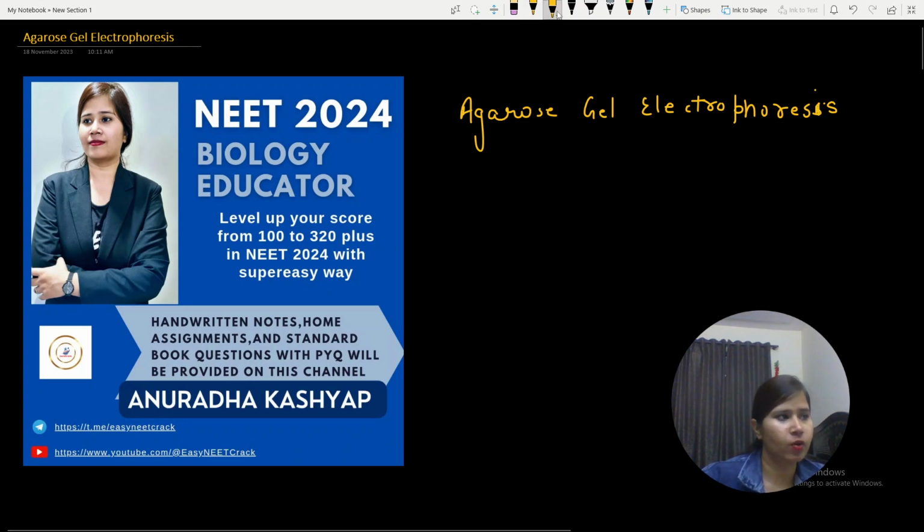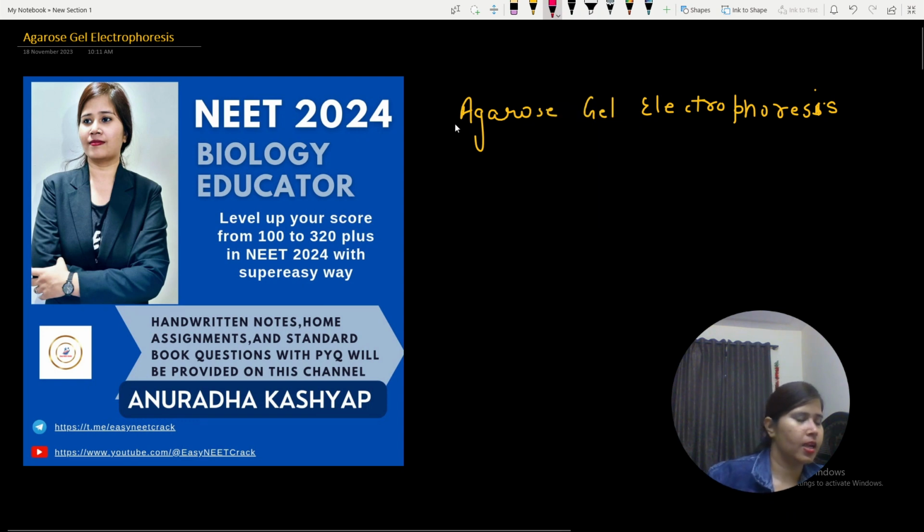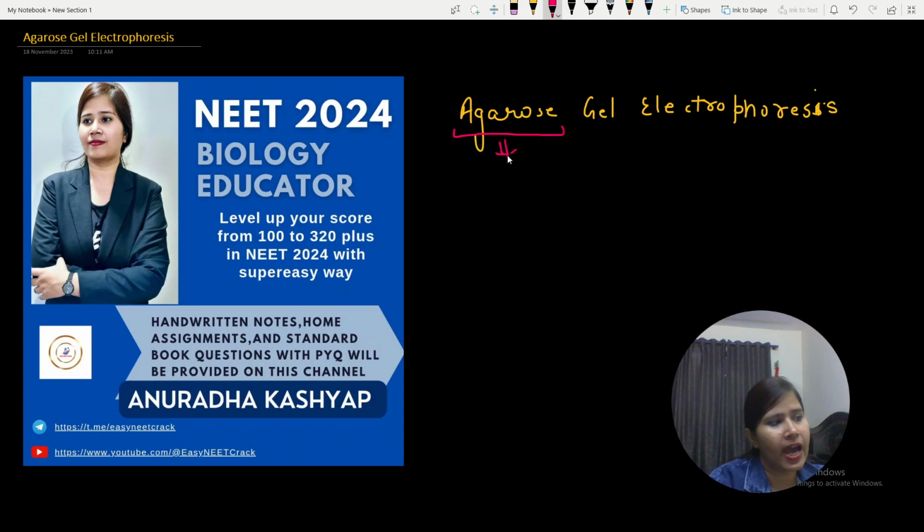So first of all, what is agarose? Students, in this technique agarose acts as a media. What is media? When you are doing any kind of experiment, you always form a basic, supportive media. It can be made up of any kind of gel, or it can act as a nutritive media for some kind of bacteria.